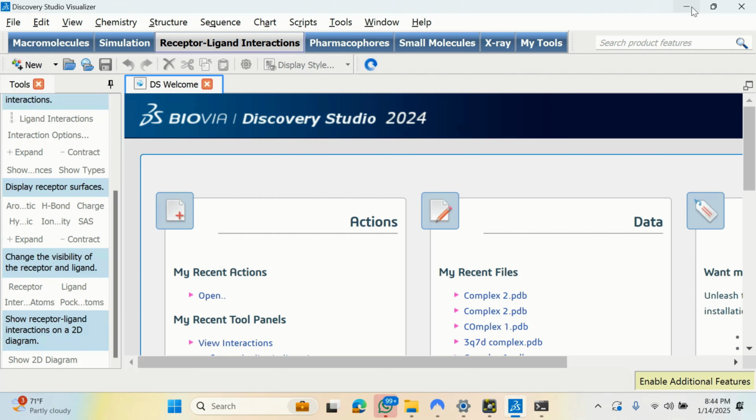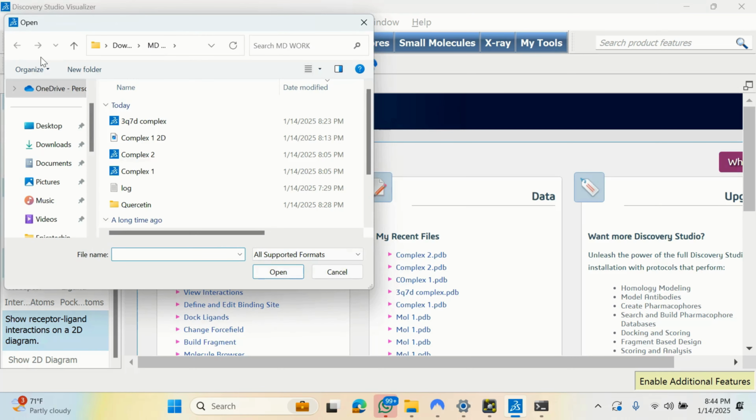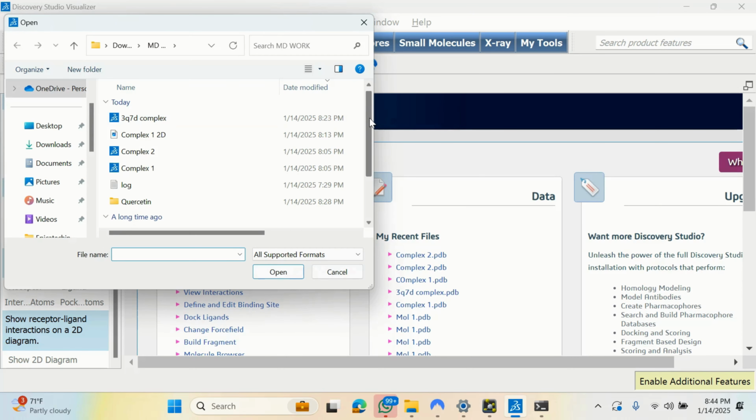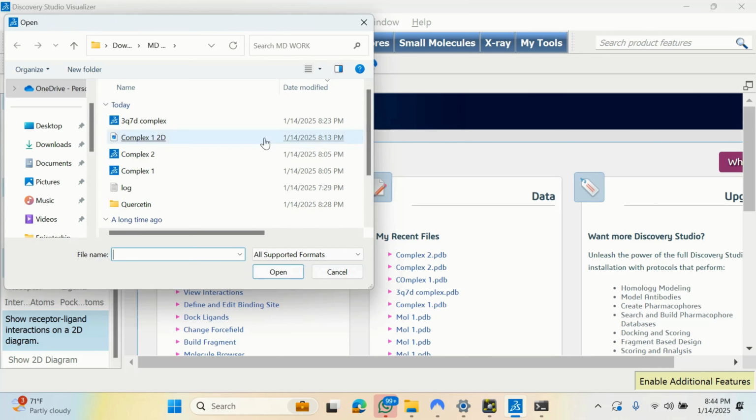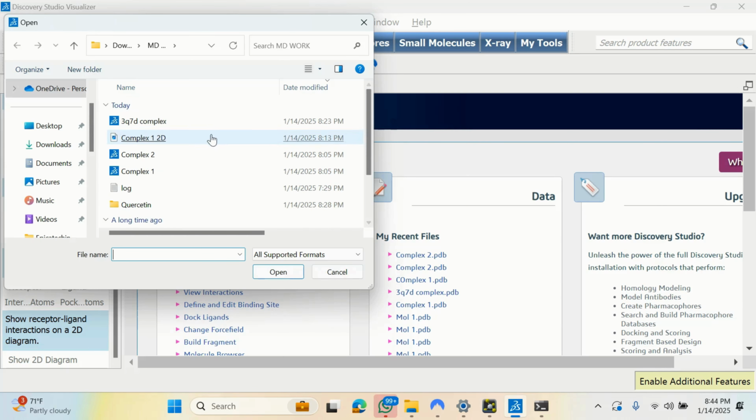So let's quickly demonstrate this with our previous study, which we demonstrated, post-docking analysis we demonstrated in the previous video. Quickly, we'll go and upload one of that here so that I'll use this and demonstrate what I mean. This is a study I just did. We just made use of it in our previous video on post-docking analysis.